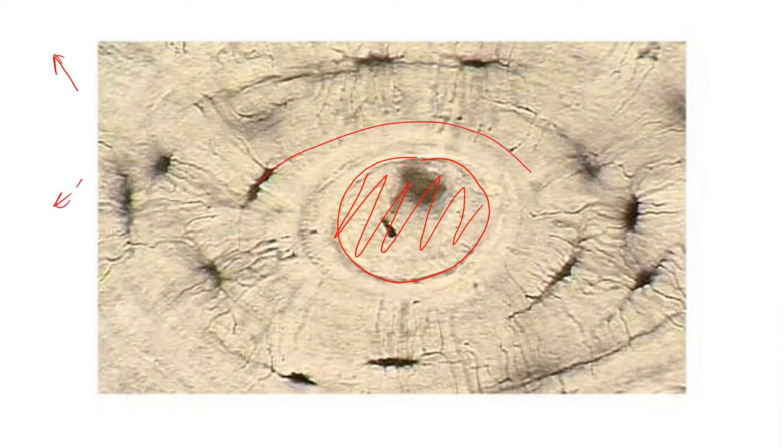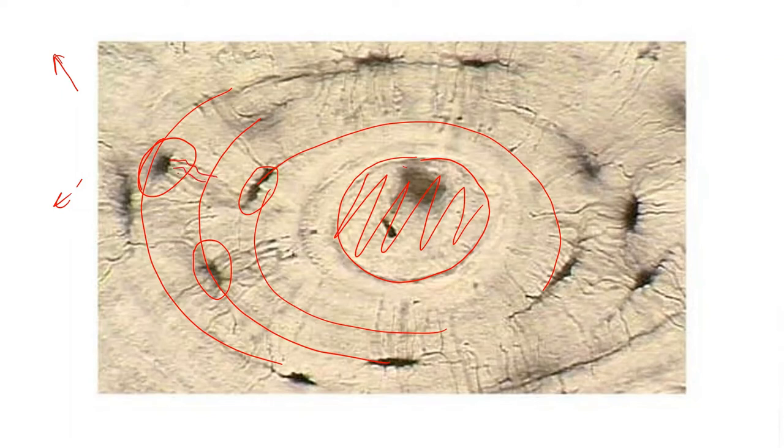But I can see a lamellar ring. I can see another lamellar ring and another lamellar ring all the way out to the edge of the osteon. I can see each individual osteocyte. And I can get a really good shot now of the canaliculi, these little tiny canals that are coming out and connecting the different lamellar layers. The brown stuff in the background is all the bony, hard, calcified matrix of this connective tissue.